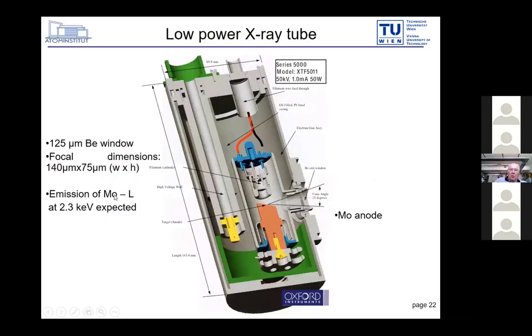Next is, why is low power so effective? Low power, of course, suffers that you are not getting 3 kilowatts, because the available power, as you have an air-cooled tube, is 50 watt, 35 watts. But you will be surprised how good is the output, for a very simple reason.